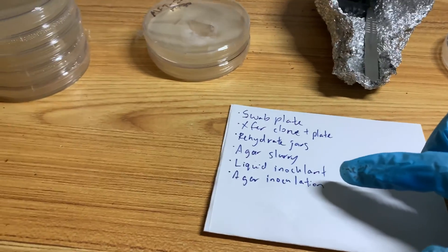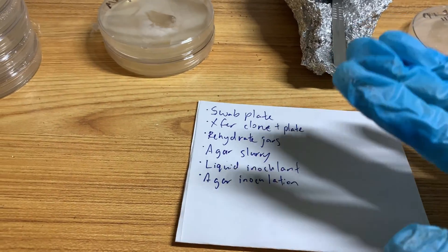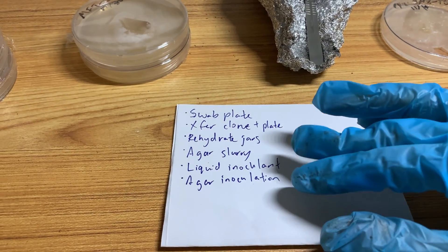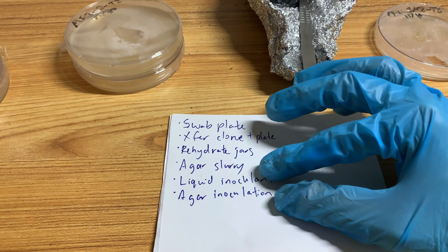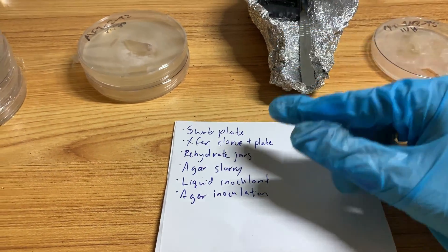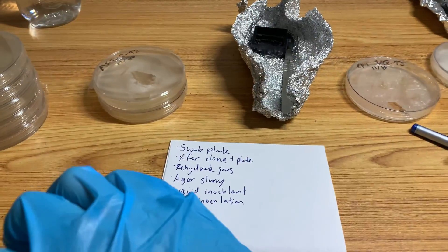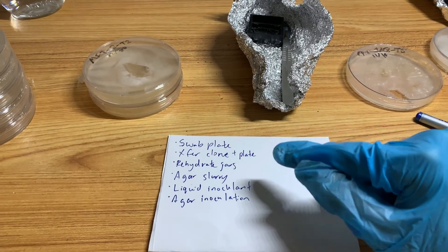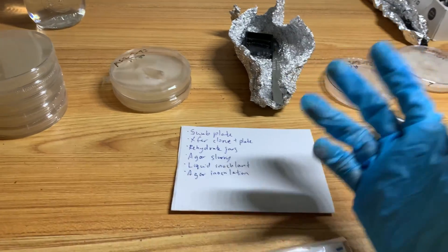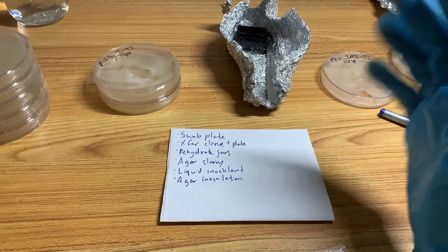My SAB is big and everything can fit in there, but it's going to be a little crowded. So I'm going to do the 10 jars after transferring the clone plate, and then after I'm done with that, I'll take those jars out and bring in the jars I want to rehydrate. It's not ideal, but it's okay — in these cases I just spray soap water again inside the SAB.